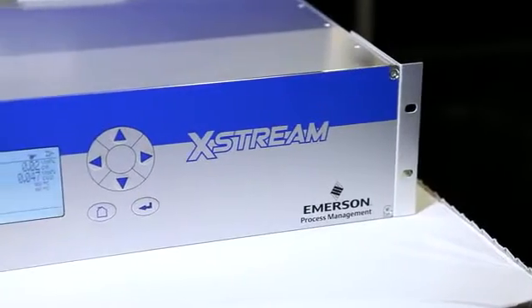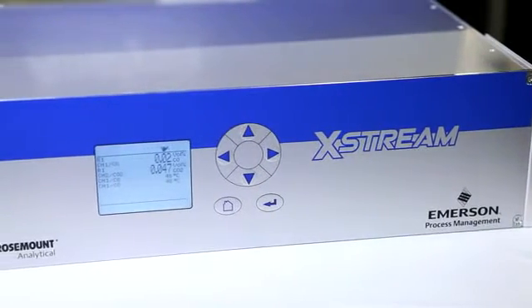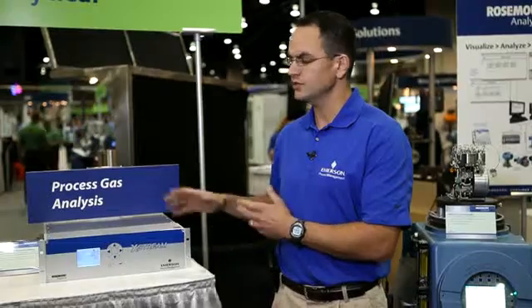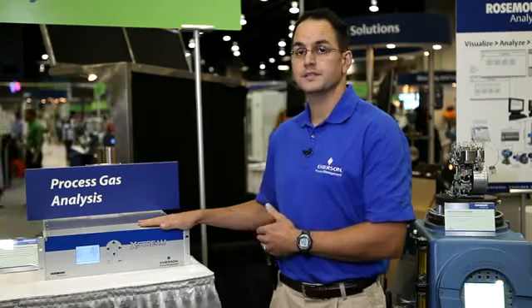On my right hand side, we have the process gas analyzer, the X-STREAM XE. The Xtreme XE comes with a variety of detectors, including an NDIR, a UV-VIS, paramagnetic O2, and even a TCD option. So you can configure the X-STREAM XE to make the analyses that you need.